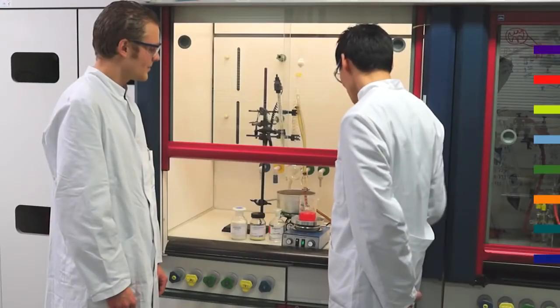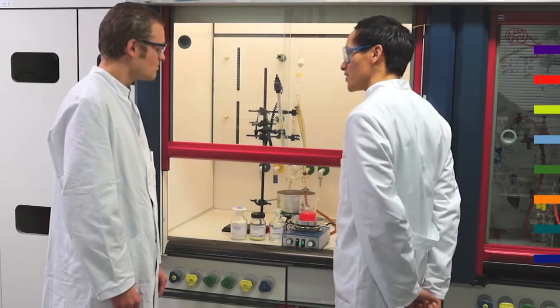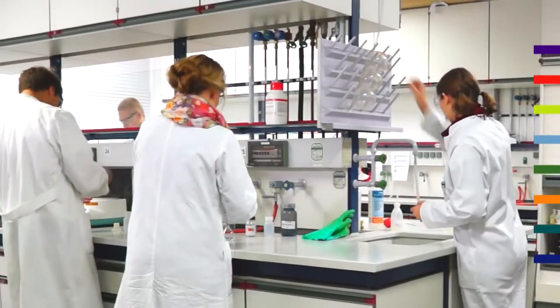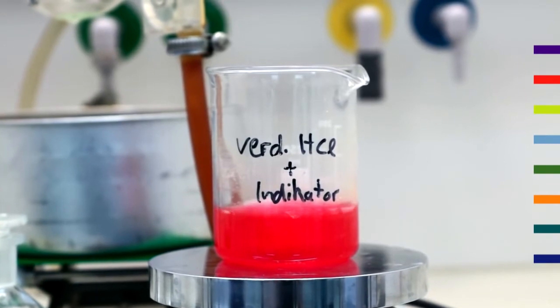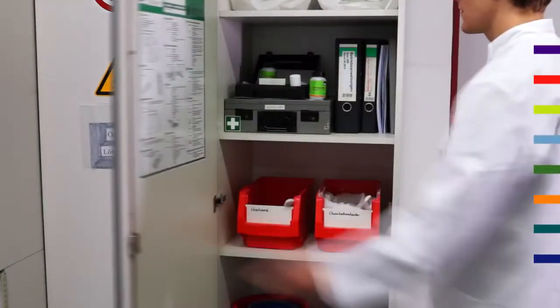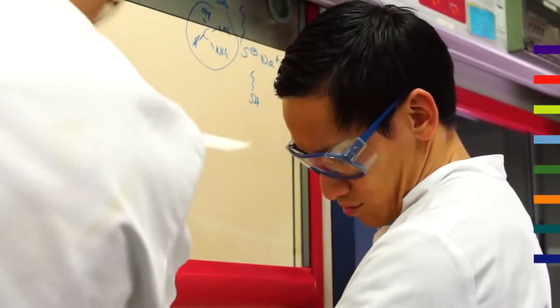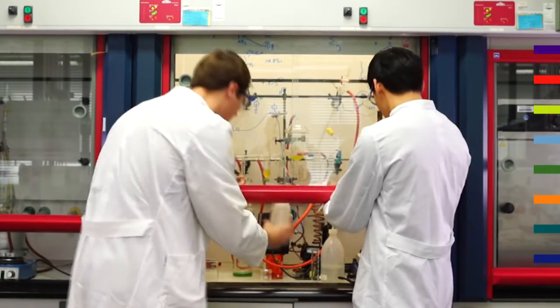Chemicals must always be stored in adequate containers, and it is vital that they are labelled. They need to be kept either in the fume hood or in specially designated cupboards in order to prevent danger to other co-workers in the laboratory. The label must be precise so that every danger can be assessed, even by a person not involved in the experiment. Now, even Smithy and Adams know that it is better to work in a fume cupboard, but even here, there are a few important things to take note of.